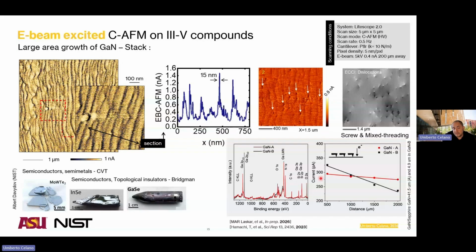So technically, you can think a little bit about that as a sort of probe-based TLM exercise that we are doing. So transfer length method, in which we are just moving our probe away and we look at the impact of additional sheet resistance kicking in so that we can extract that. In case of identical material, they will show up identical. In case of thickness dependence like this, they will show up the difference in thickness. In case of a difference in sheet resistance, of course, you can pick up the difference in sheet resistance.